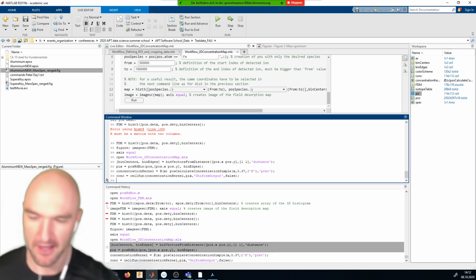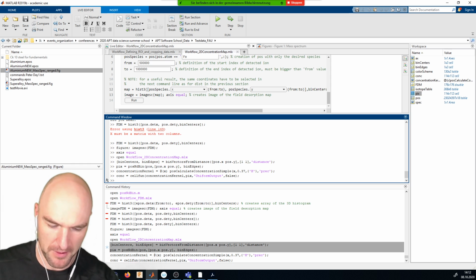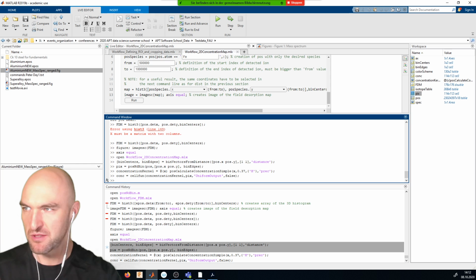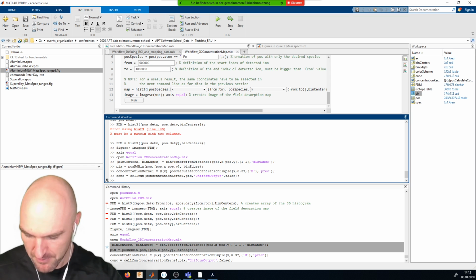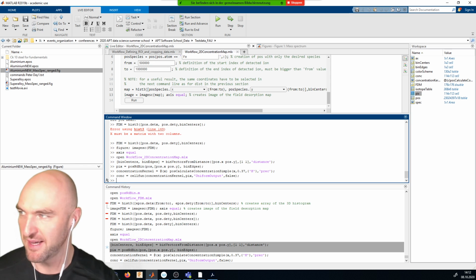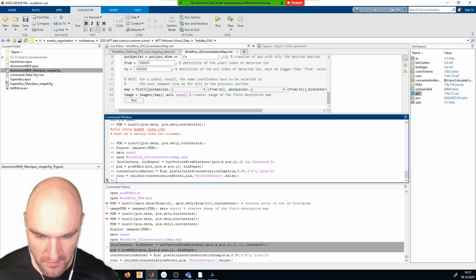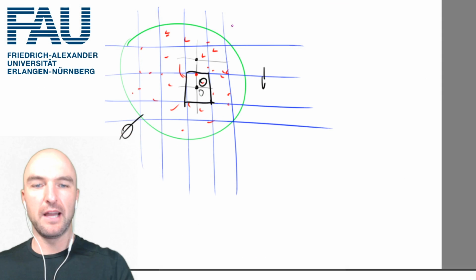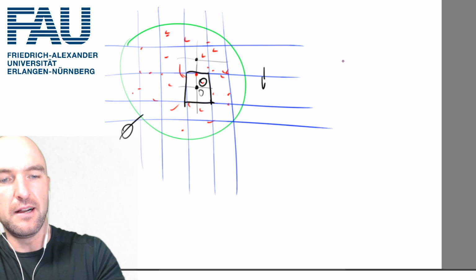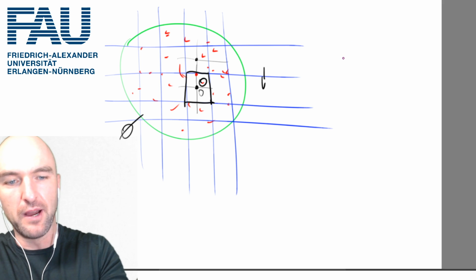And there are actually pretty good schemes to do that in 3D. So far, what people have done is using a delocalization function, which, Andy just said, is a Gaussian blur. But this makes the transfer function user dependent, so I think that's even worse. But I can show you a little scheme of how this can be done in 3D without any free parameters.